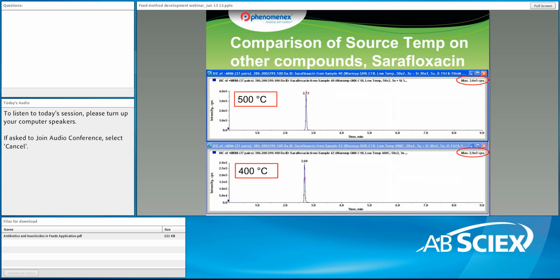So then the next obvious question was, all right, we can see the abamectin and ivermectin that elute at fairly high organic concentration in the mobile phase. What about the early eluting peaks that don't have fairly good signal and elute at mostly aqueous components? So the mobile phase is harder to desolvate. Do we lose some signal? The answer is yes. Is it catastrophic? No. So at 400 degrees Celsius, we can still have good sensitivity, even though we lose a little bit of the signal.